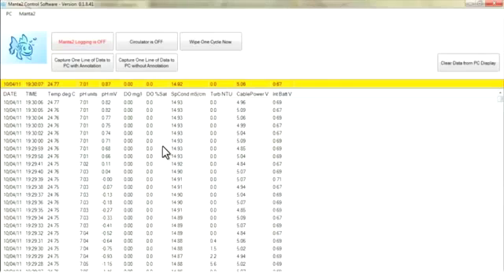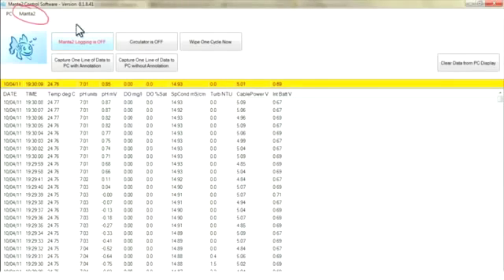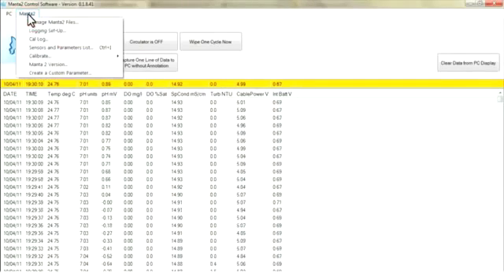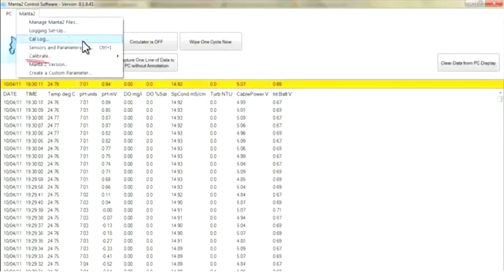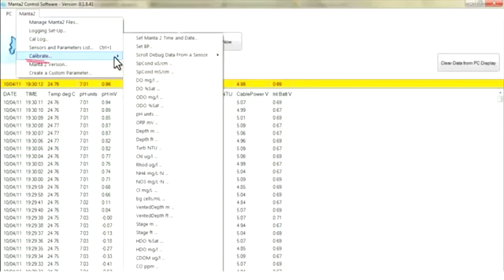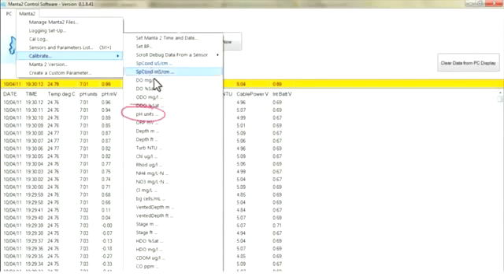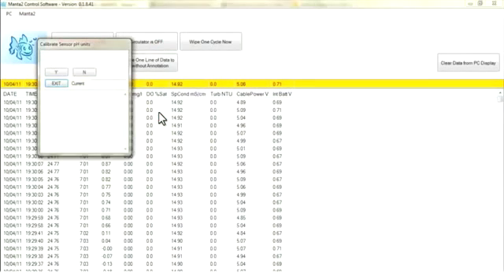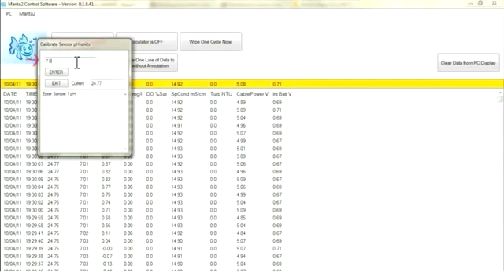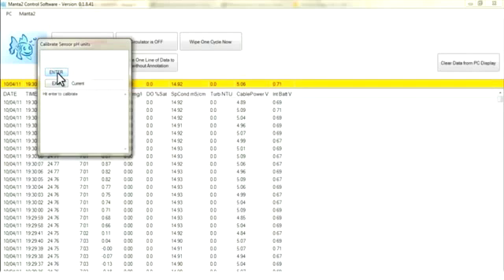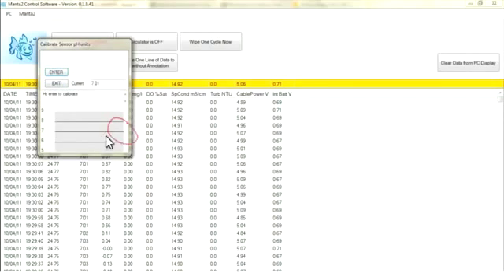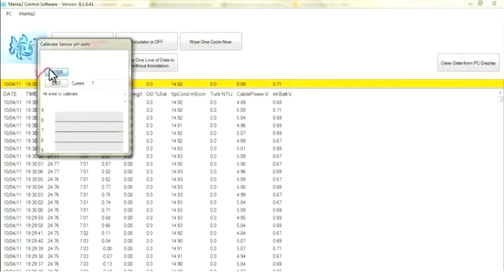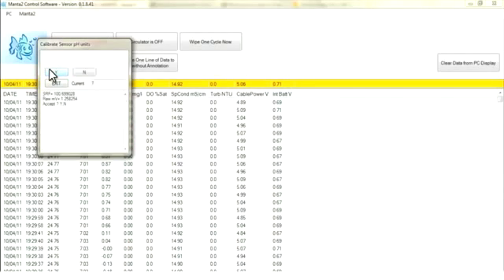Cover up the sensors. Hit Manta 2. Calibrate. pH units. It says enter sample 1. That's what we have in here. 7.00. Enter. Comes up with a graph. Wait till that stabilizes. It's stable. I hit enter. Accept. Yes.